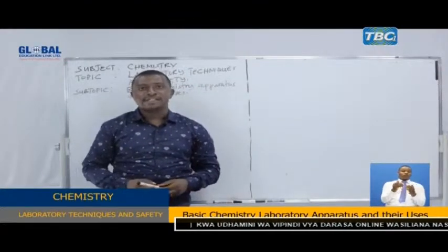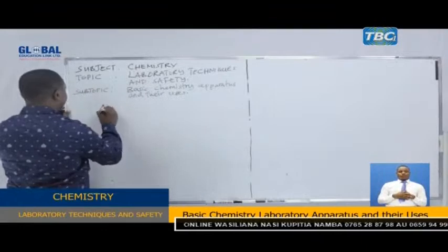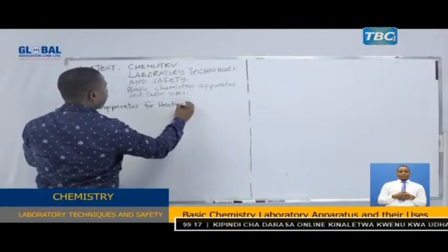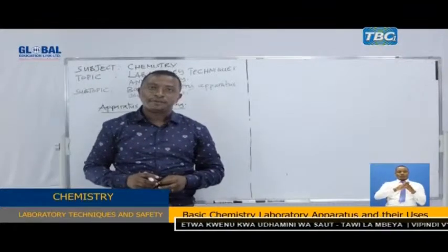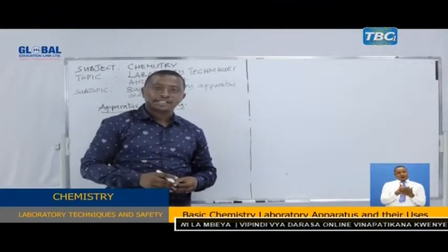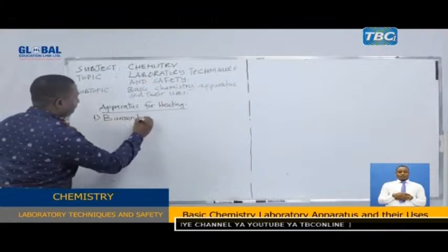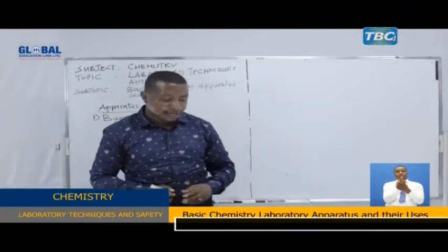Dear students, let us now see the apparatus for heating. There are several apparatuses used for heating. Today I've tried to come with some of them. Let us now see them. We have an apparatus known as a Bunsen burner.